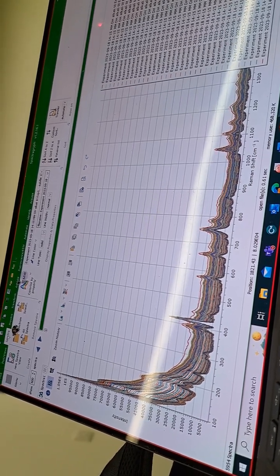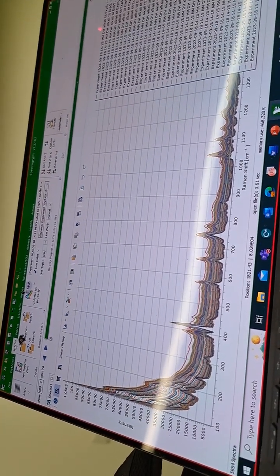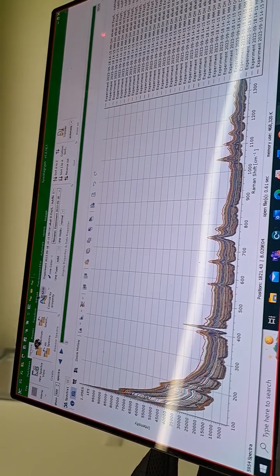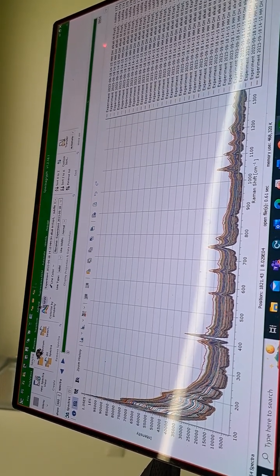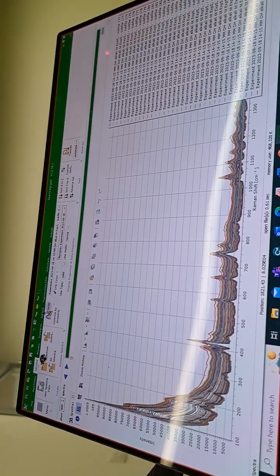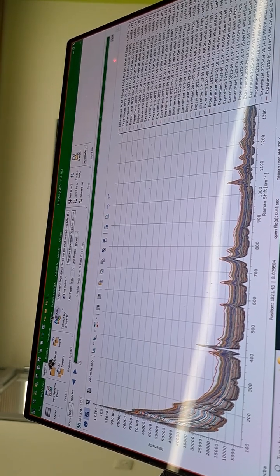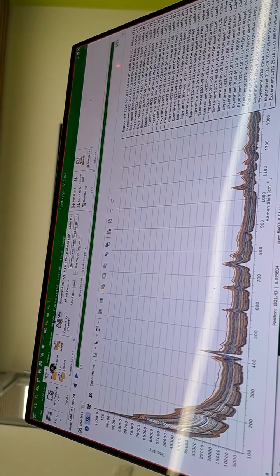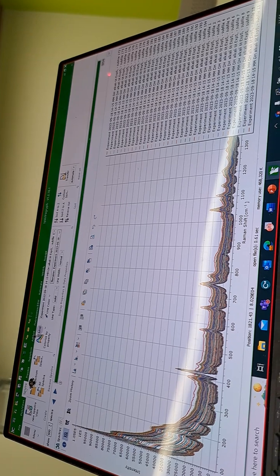You definitely had 3 spectra a minute. Yes, like in the method, yes. 3 spectras in 2 minutes. Sorry? 3 spectras in 2 minutes. 3 and 2. You said 3 and 1. No, 3 in 2 minutes.